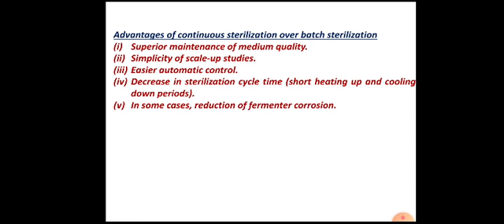In some cases, there is reduction of fermenter corrosion. If batch sterilization is done in the fermenter itself, then certain media components may react with the wall of the fermenter at high temperature. It may cause corrosion and damage to the fermentation vessel.